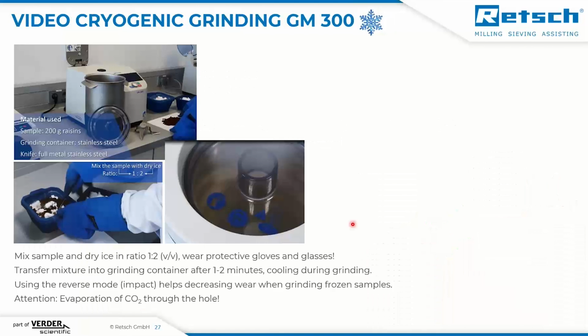So there are also videos which show the cryogenic grinding in the GM300 and GM200, which are included in the download package. So here we can only show some screenshots. And the procedure is the following. You mix a sample with the dry ice, for example, here the raisins, in a ratio of 1:2, and importantly, wear protective gloves and glasses for your own protection.